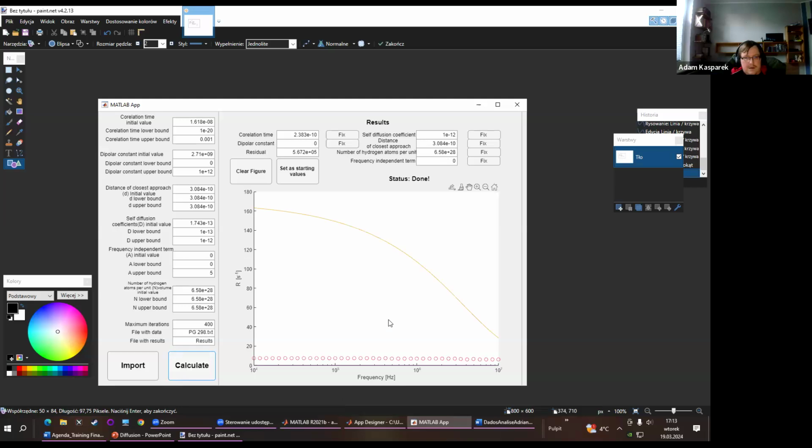Okay. Oh, and the fit was much worse. Actually, the problem was that I put this upper bound here, and frankly, it will be much bigger. So let's put here a value of water in this temperature. Let's check what the program will do now.